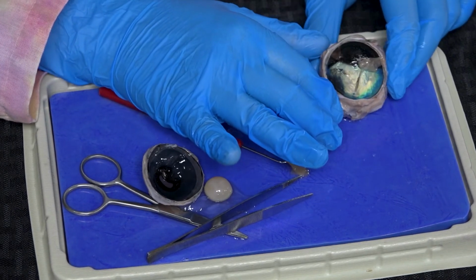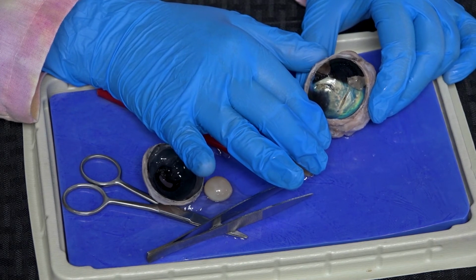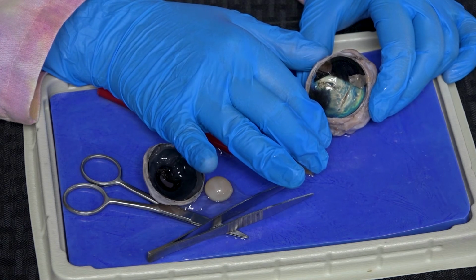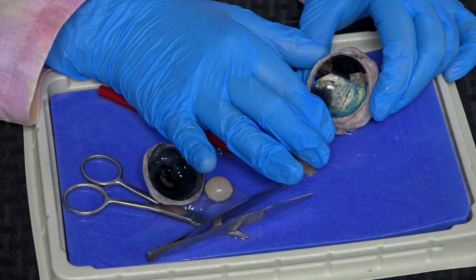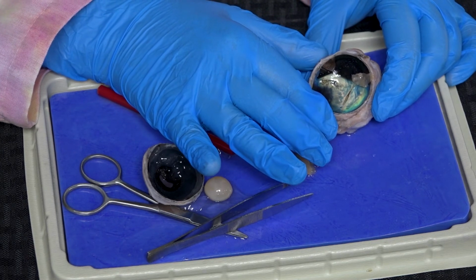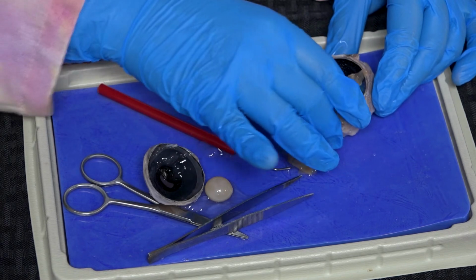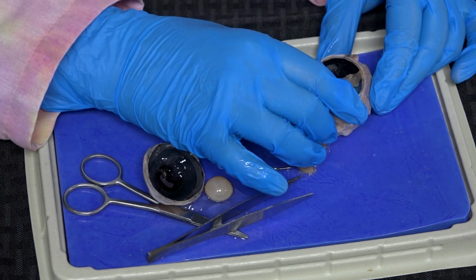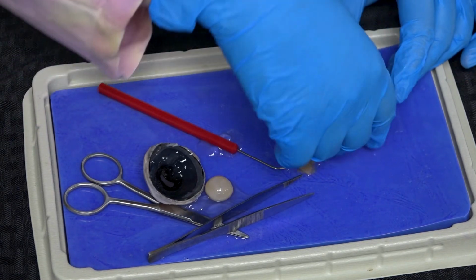Why is it humans don't have that? Well, I think that's because we weren't traditionally active when it was starting to get dark, so we didn't need it, like animals like deer, who feed a lot during those times of the day. So humans don't have it, but a lot of other animals do. And I won't peel it away, but there is a little bit more tissue underneath that has more of the blood vessels and whatnot. And again, let me show you.